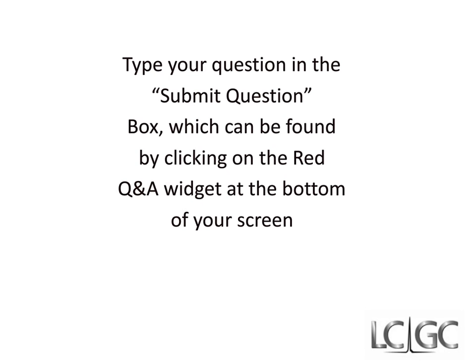And our first question, Michael, is what do you find more critical for the optimized LC method? Baseline resolution for all compounds or quick overall run times?